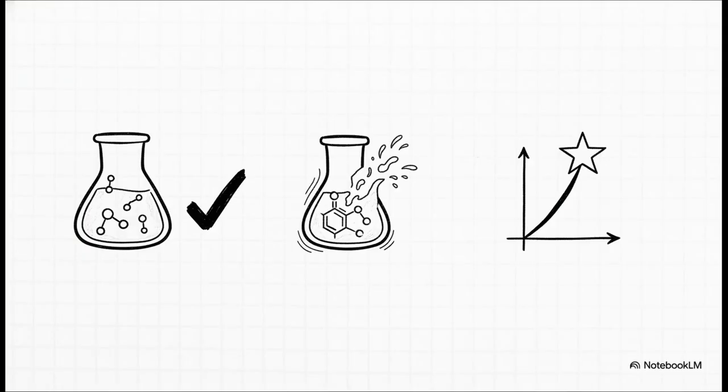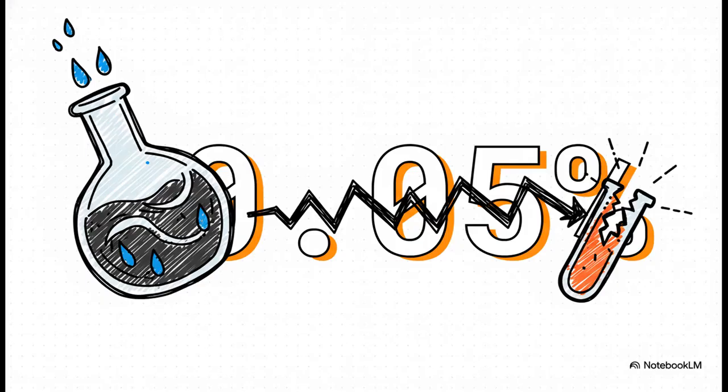The advantages are huge, right? It lets us accurately measure a whole class of chemicals that were basically invisible before. This is especially true for organic stuff that won't even dissolve in water in the first place. It gives us those super sharp endpoints we've been looking for. But, and here's the big catch, this whole process is incredibly sensitive to its old enemy, water. Get this, you can't have more than 0.05% moisture. That is an insanely small amount. Even a tiny trace of water can completely wreck the whole experiment.